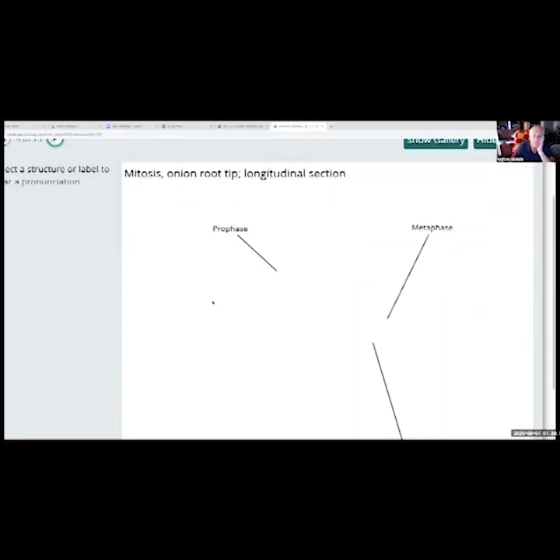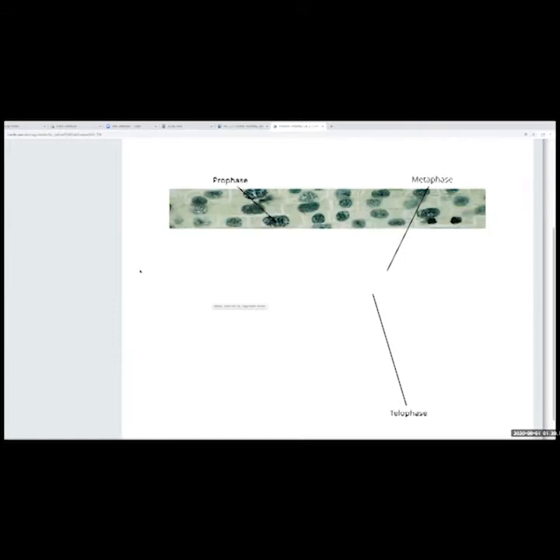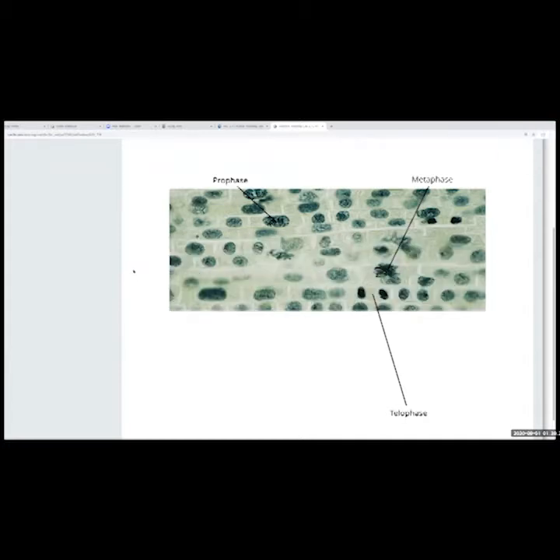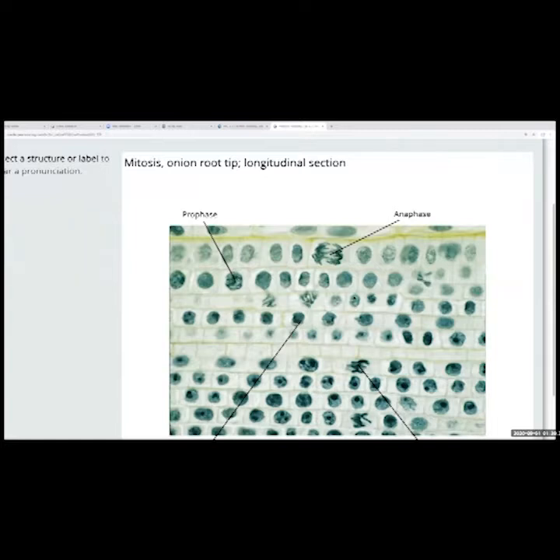Again, more slides to look at through your microscope. I had a question about the last slide. Why was there a blank line in the middle, on the last slide? Yeah. Let me go back. A blank line. Yeah, it looked like there were only cell walls, but nothing. Oh, right up in here, yeah.